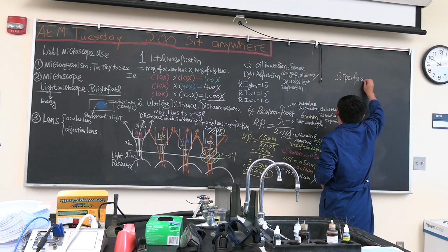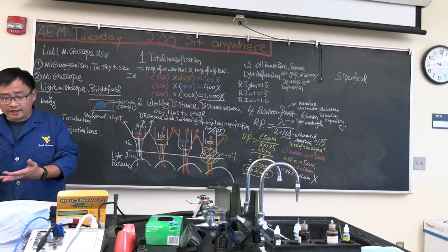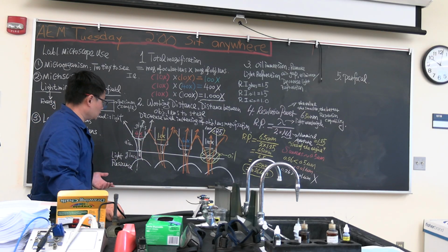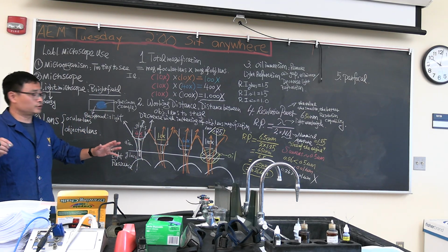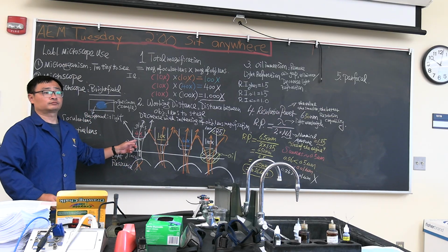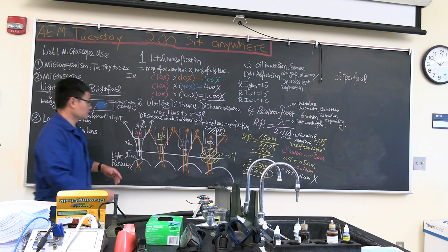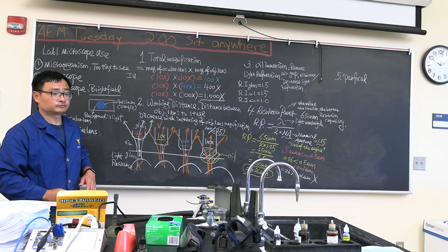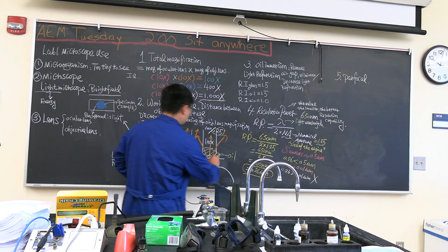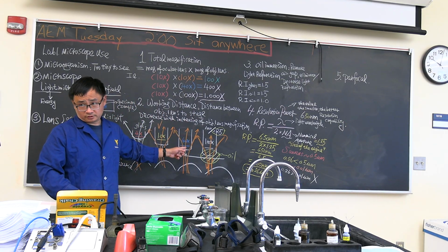parfocal. So what does parfocal mean? We have these lenses. Now, by the way, I want to say this here. In this classroom, we will never use 4x. So forget about it. We will always start to find the specimen with 10x. Then add 1 drop of oil for oil immersion, and switch to 100x. 40x we will use only once.